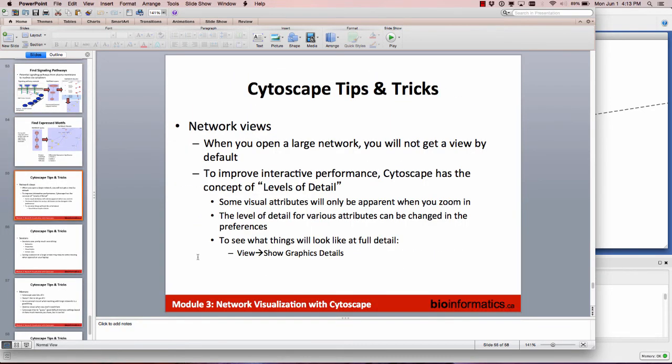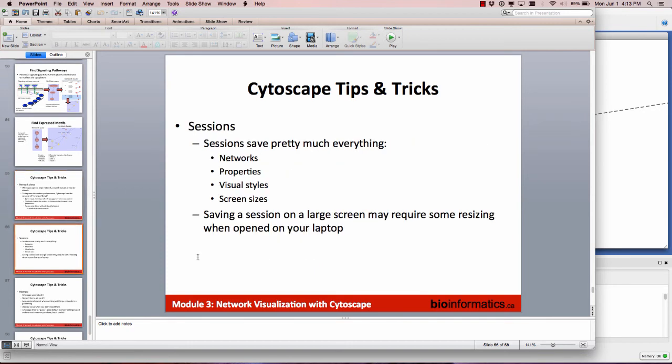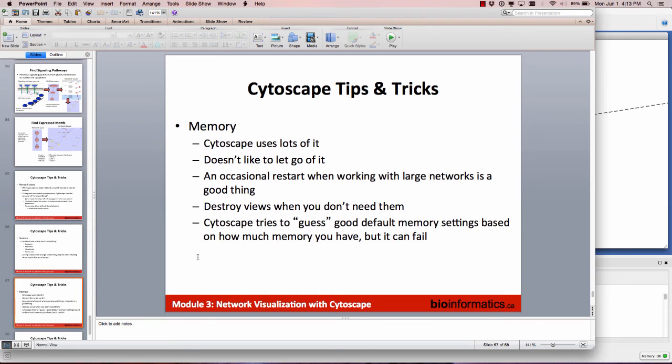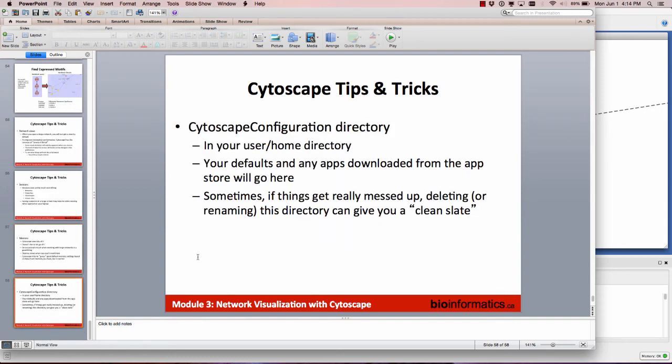The last few slides are tips and tricks with Cytoscape. If you end up using it a lot you might want to look at these. For instance, if you use it a lot and it starts running out of memory, you can increase the memory allocation - these are more advanced options.